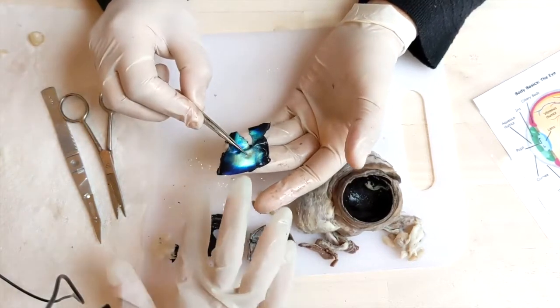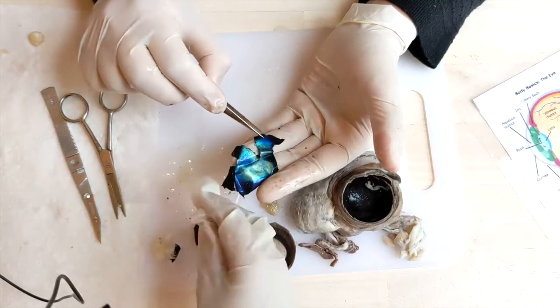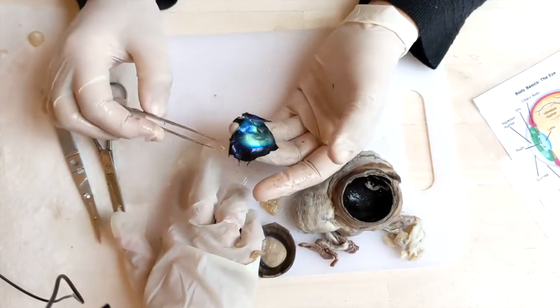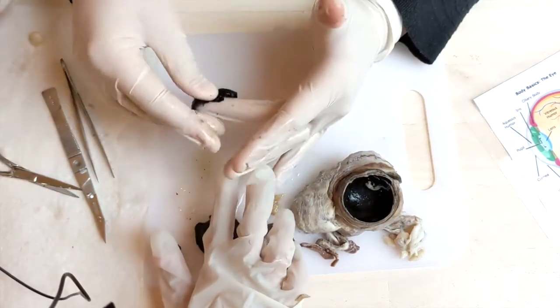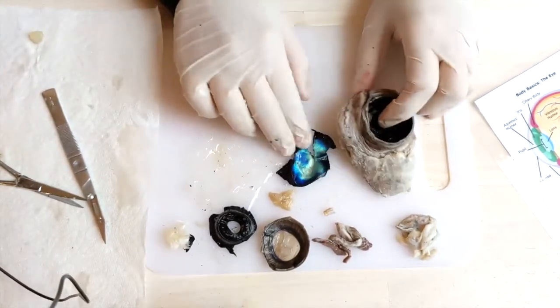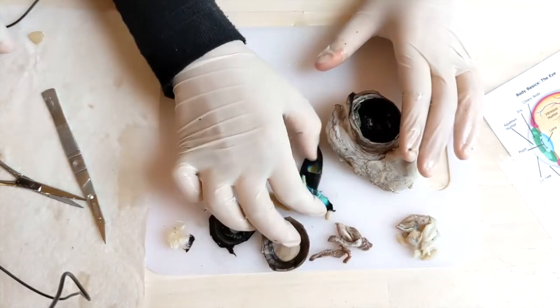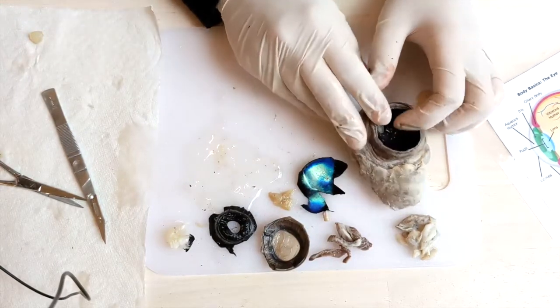So they used to be active at night, until we discovered the advantage of the meat and the milk, and we domesticated them. But they still have that because this is just their genetics. It can't go away. Yeah, so that's pretty much it. So this is the anatomy, and these are the parts of the cow eye, and I think that's pretty much it. Do you guys have any questions?